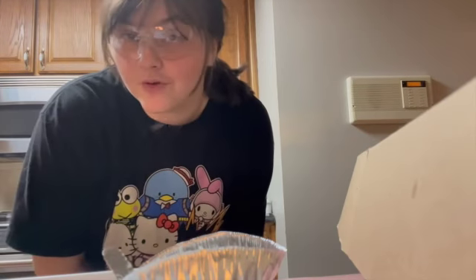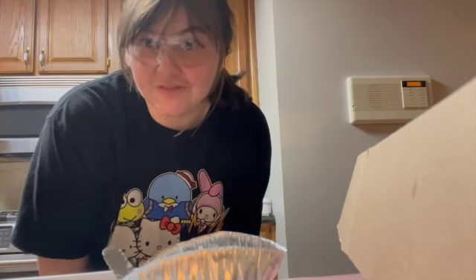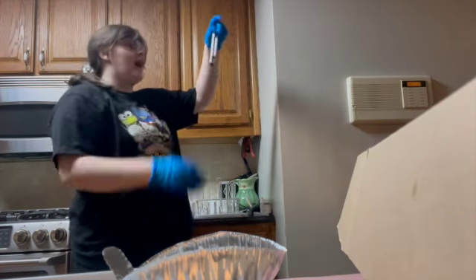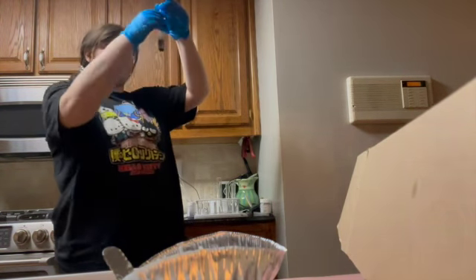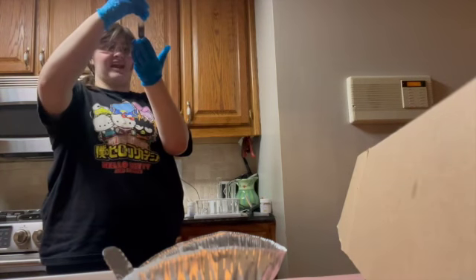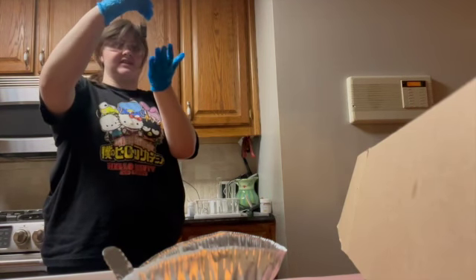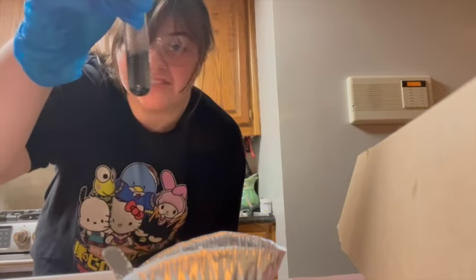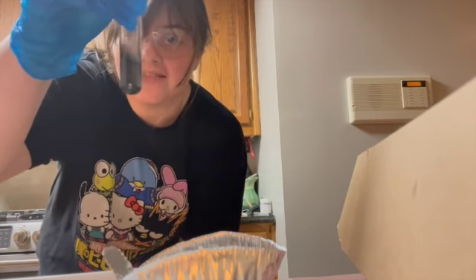So we're at the 34-minute mark for our reaction 4, and I see something very interesting happening. There's still a good amount of it settled at the bottom, but it is clearing out. No matter what I do, it seems to want to settle. Even agitating it brings it back to this state.